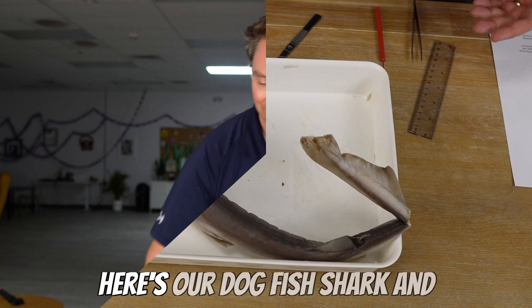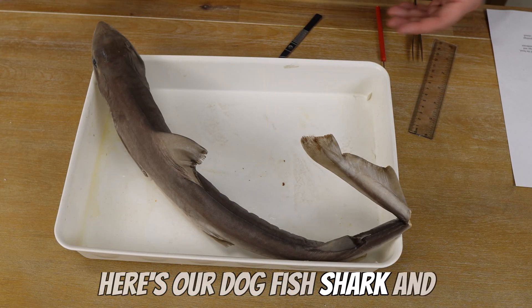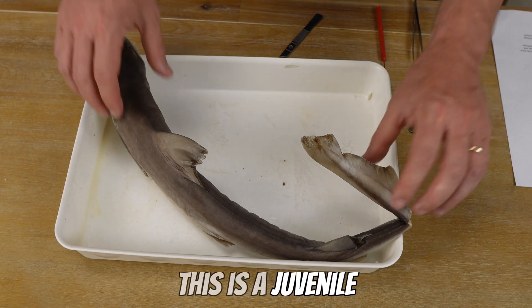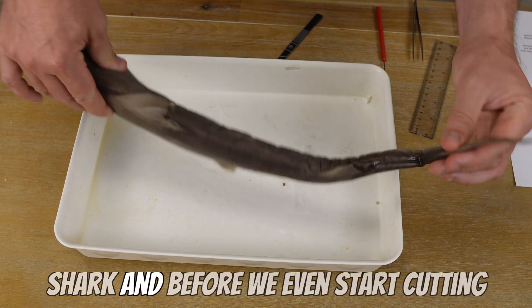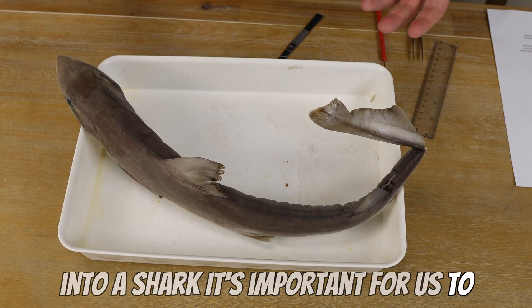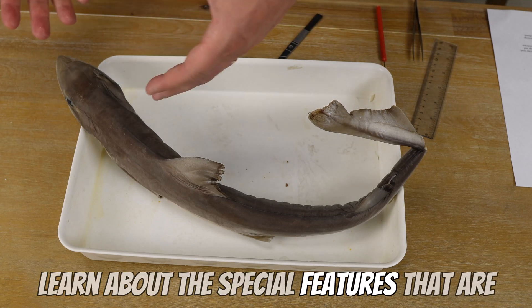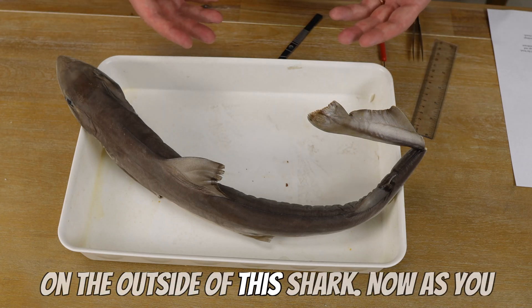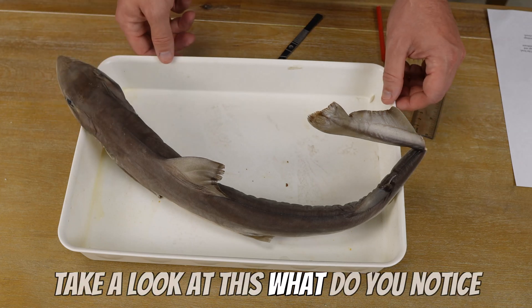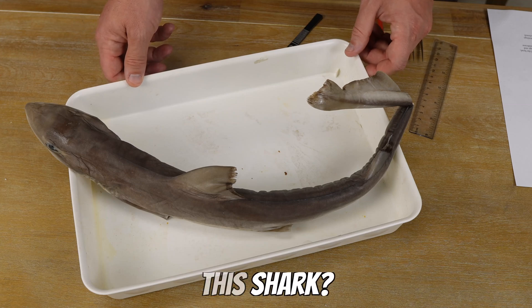Here's our dogfish shark. This is a juvenile shark. Before we even start cutting into a shark, it's important for us to learn about the special features that are on the outside of this shark. Take a look — what do you notice?